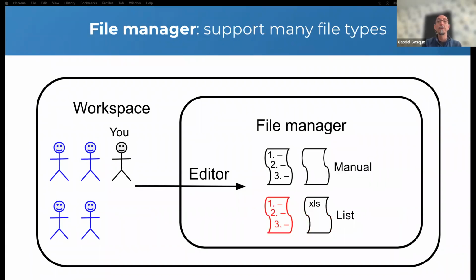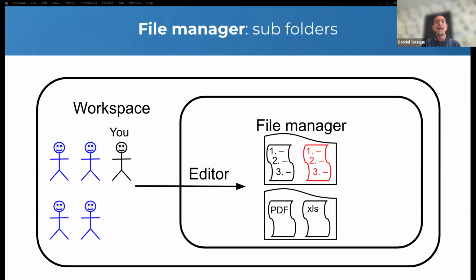As I mentioned previously, the file manager supports many types of documents, not only protocols. You can upload PDFs, Word documents, and Excel spreadsheets. And all files can be further organized into subfolders.